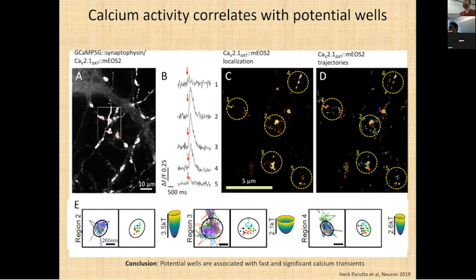It depends. What do you mean? If, for example, the immobilization results from a potential well, you will detect it. If it's just that the molecule doesn't move at all, you will still detect it, because in the trajectories it should move at least a little bit, and then you will identify this structure. We have a multi-scale aspect of this, which will come when we play with the software.